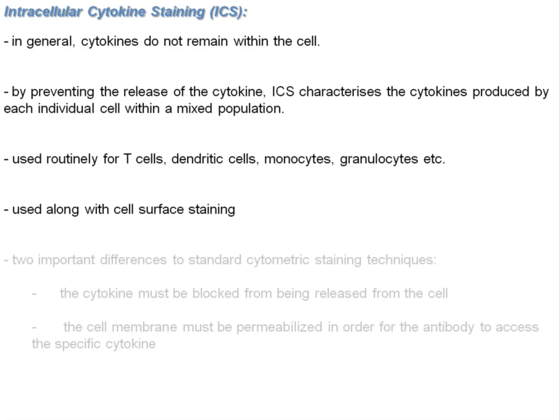And then, as I spoke about, we can also tie this along with cell surface staining, so we can identify cell markers, and also maybe we can use it with cell activation markers and other features that are expressed on the cell surface.